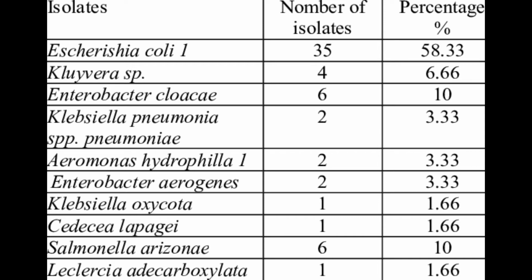The procedure is, using a wire loop or wire needle, get the inoculum and do simple streaking across the slant, then incubate. The reagent is added after incubation: 2 drops of sulfanilic acid followed by 2 drops of alpha-naphthylamine. The positive result is the formation of a red azo compound on the slant, p-sulfobenzene azo alpha-naphthylamine.